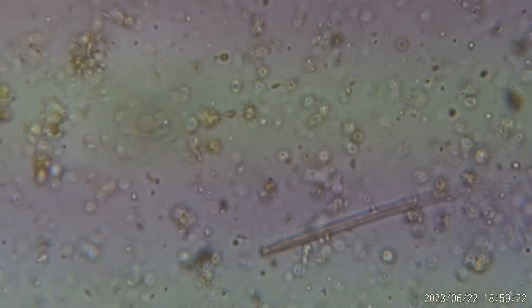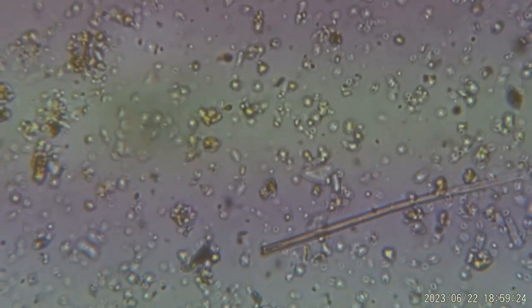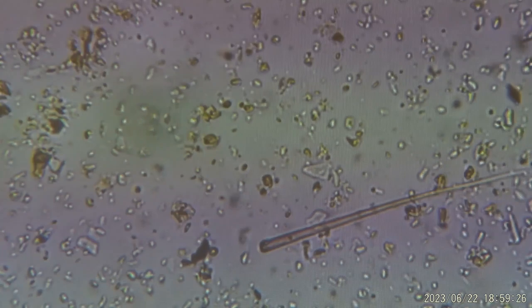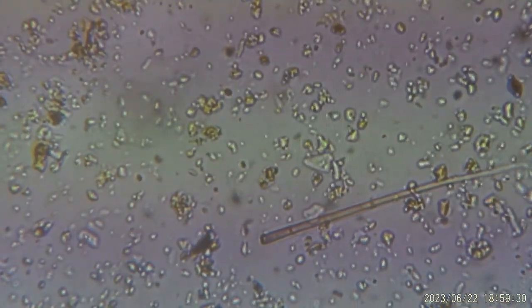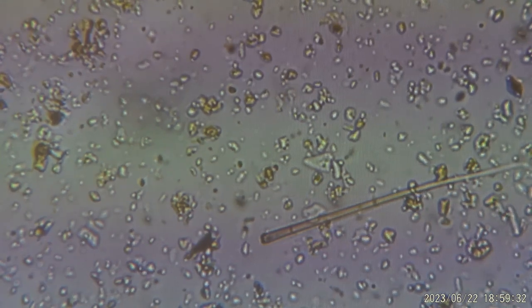Here, let's take a look at this thing here. Yeah, let's take a look. Nope. So you see how it actually starts off with, actually wait, no. It's just laying across. So that does look like a fungal hyphae. It's just that it's at different depths, right?